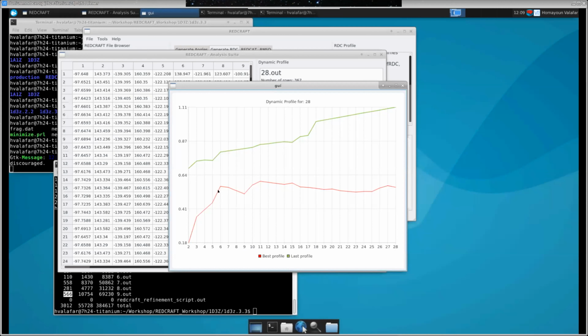From that point forward, this dynamic profile should plateau and remain constant unless there is a big jump observed. When you see a big jump, that means something needs to be addressed. So as long as this pattern is observed and your plateau is approximately at your expected experimental error level, then your structure is sound and reliable.